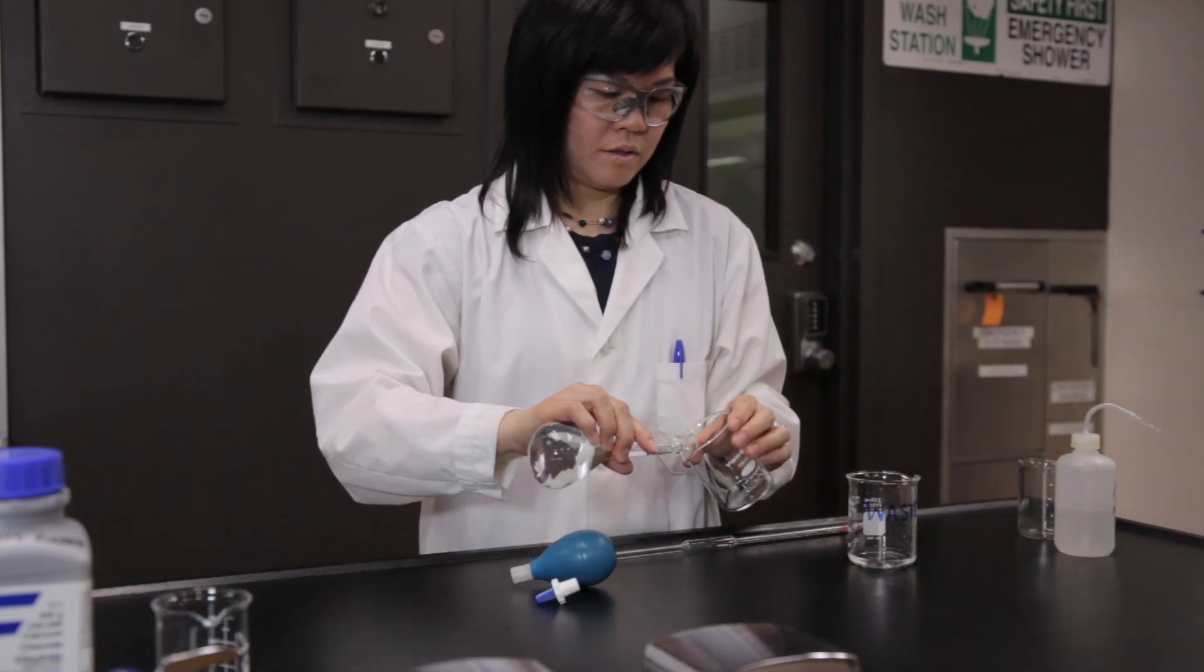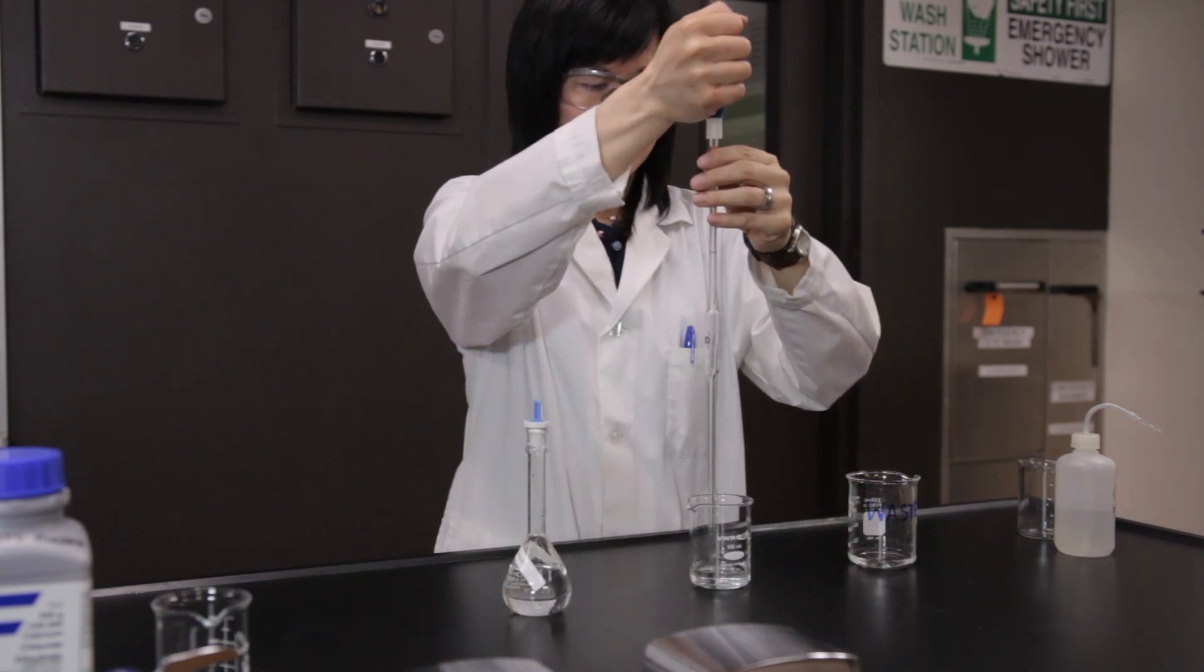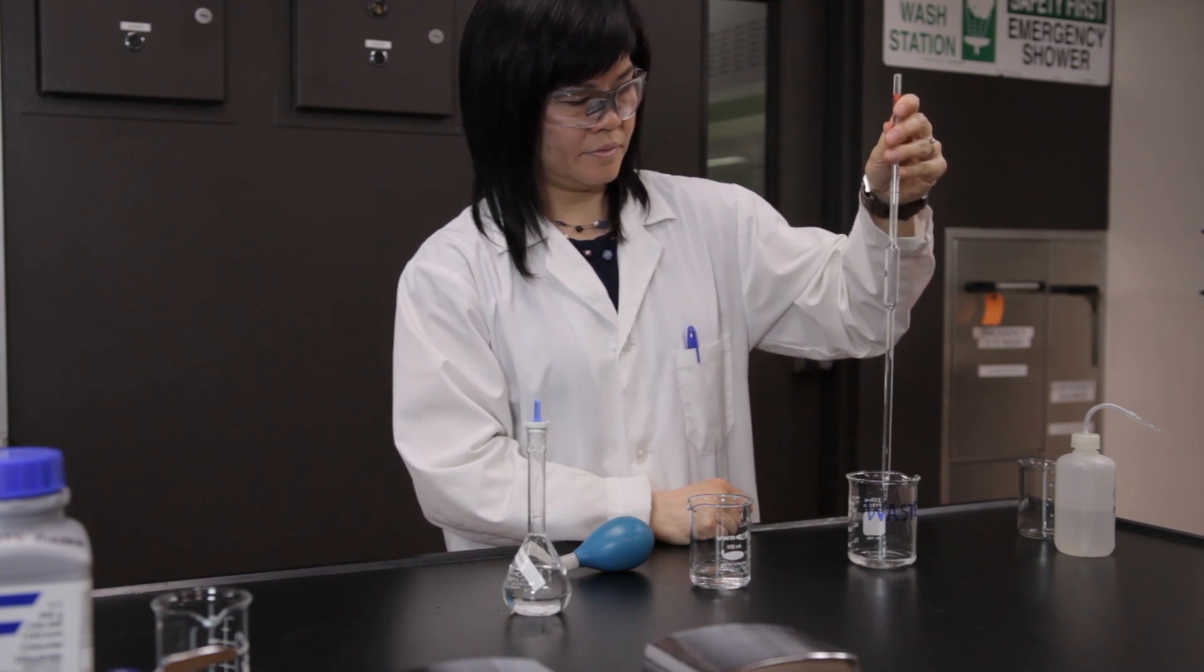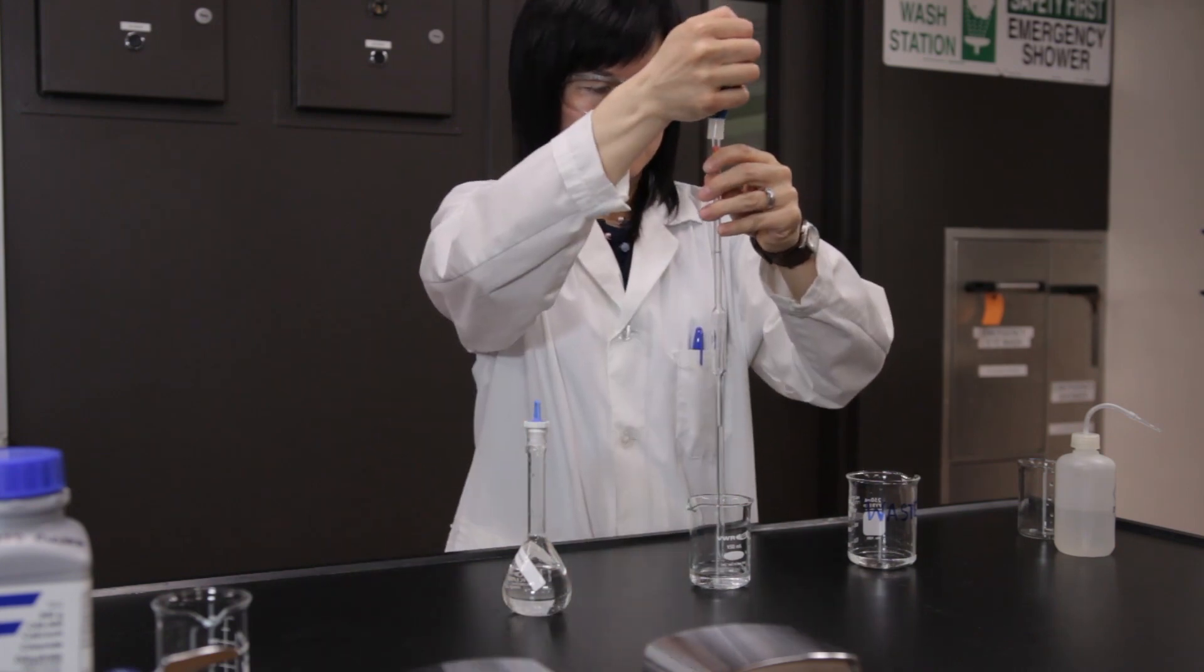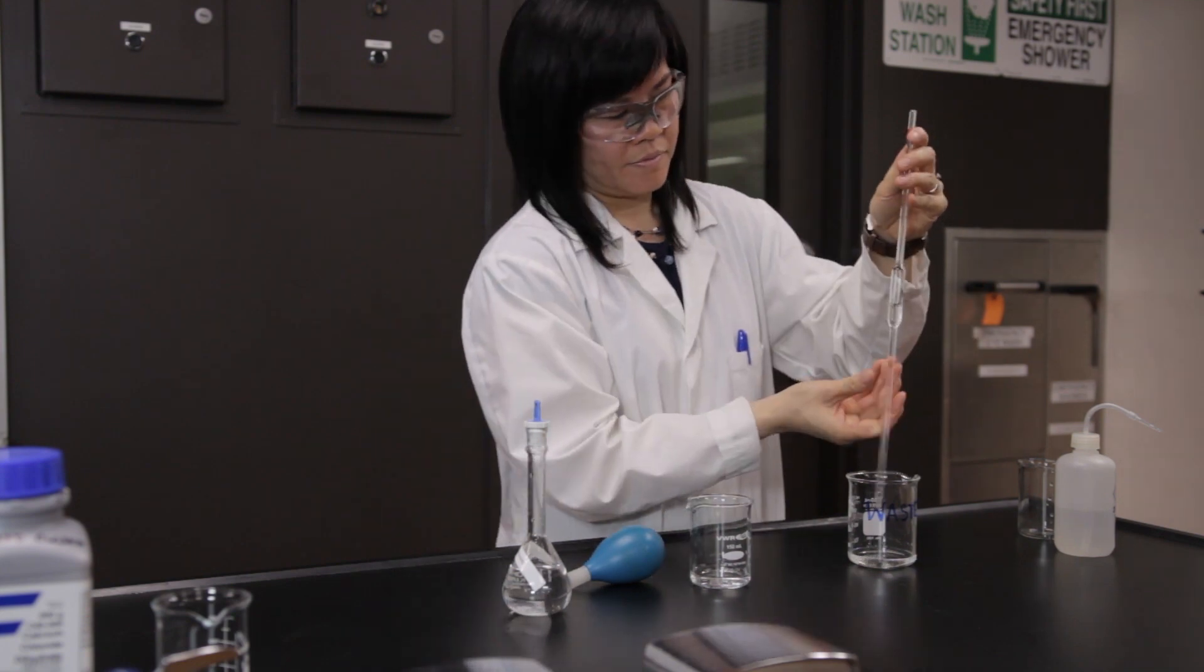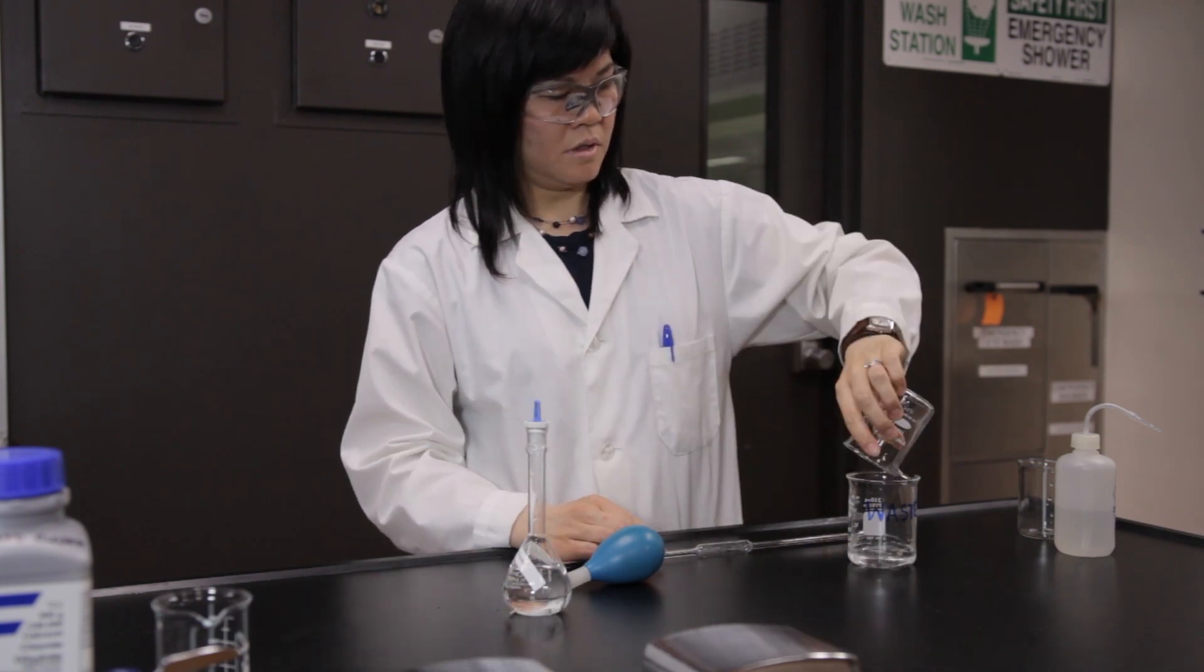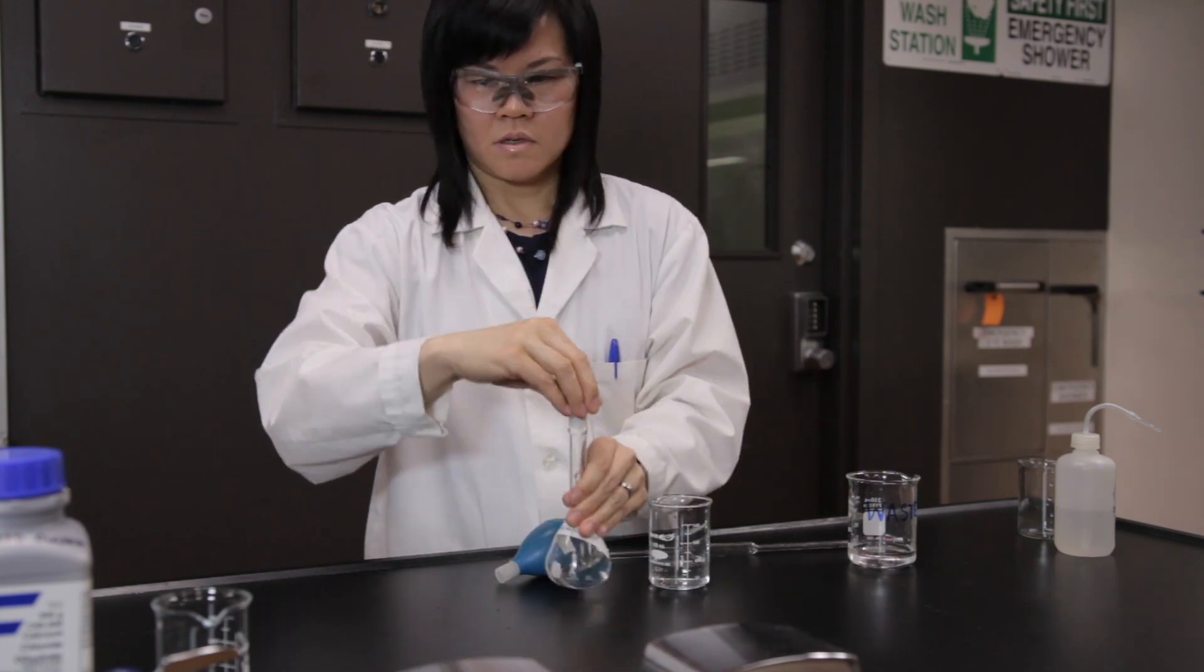Add a sufficient amount of the calcium chloride dihydrate solution into the prepared beaker and rinse the pipette two times. Refill the beaker with approximately 20 milliliters of the calcium chloride dihydrate solution.